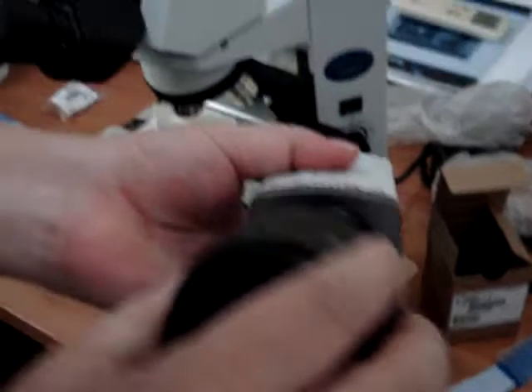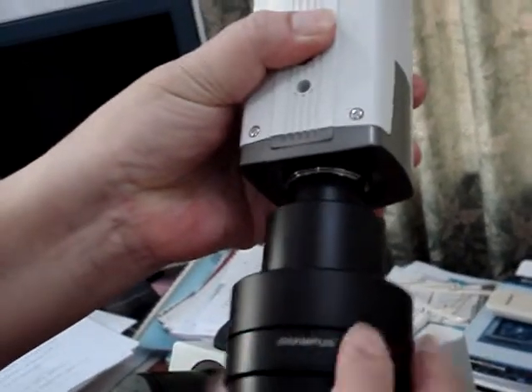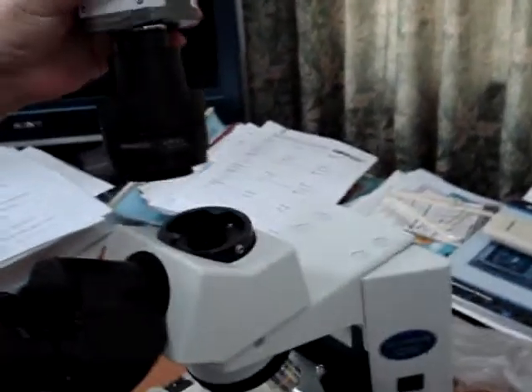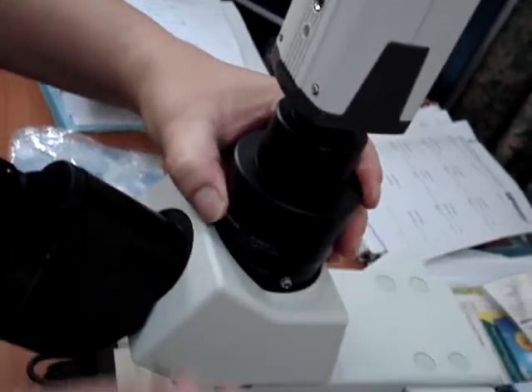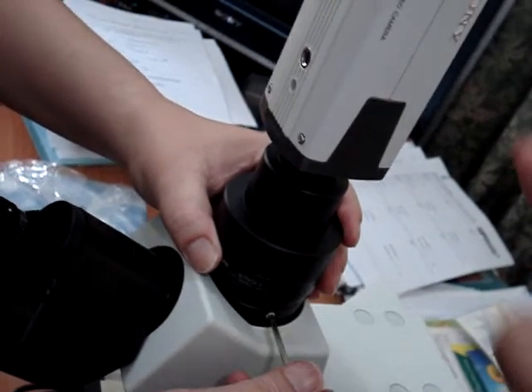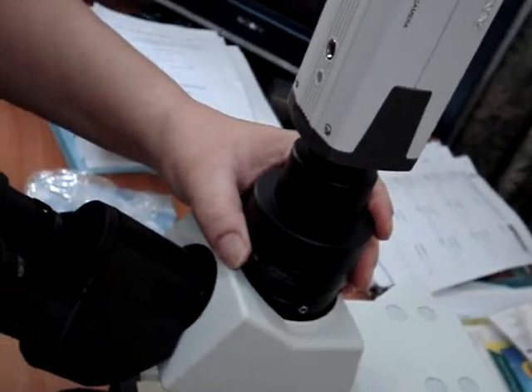Assemble it — see now, the adapter to the trinocular tube and lock it. This only has to go to this side. Lock it and confirm.